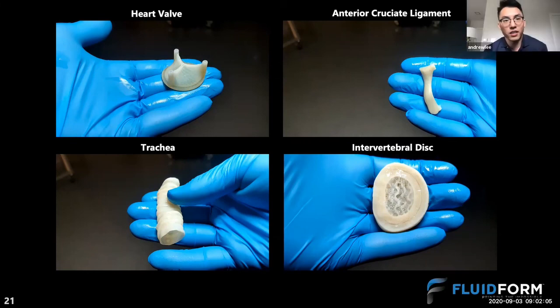Yeah, I think the separate nozzle question is definitely a yes. It depends on your setup, your system. It gets somewhat tricky to arrange different nozzles to print different regions of the print. But that is also the fun part, how do you design the print so that it is now more complex. I think the second part of the question was, can you remove the uncross-linked material? Is that correct?